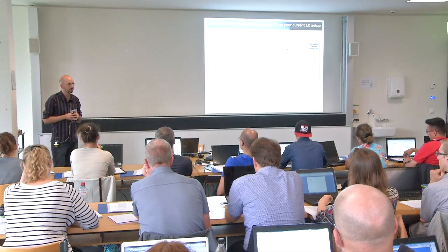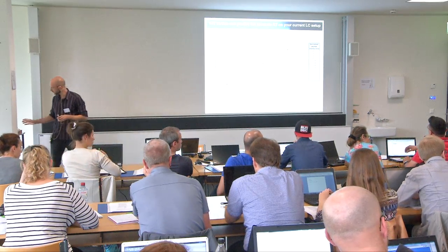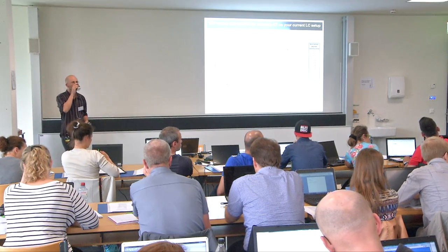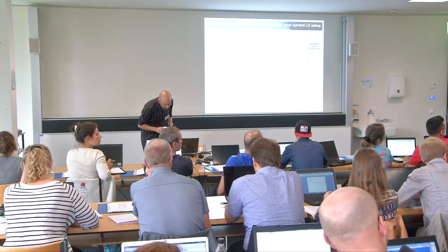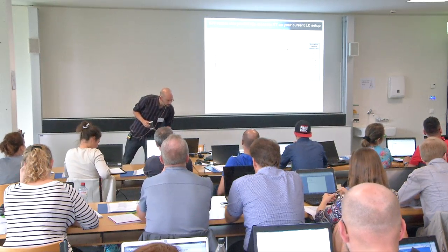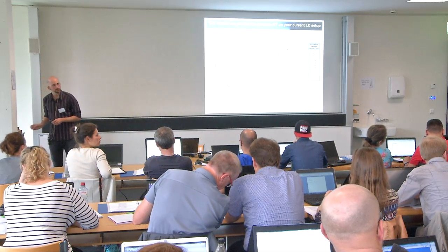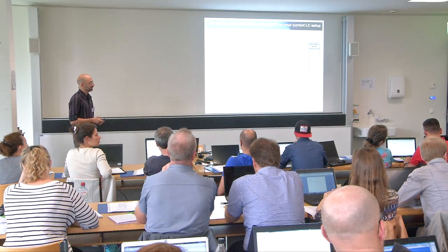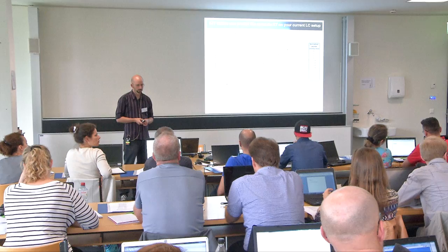That's also a possibility. Can I add just very quickly? It's definitely true that it's possible to compare IRT values, just not immediately. You must do one more conversion step. But it's not that they are lost. This is always possible because there will always be shared peptides between both labs, and these you can use to make a good calibration. It just takes one more important step.